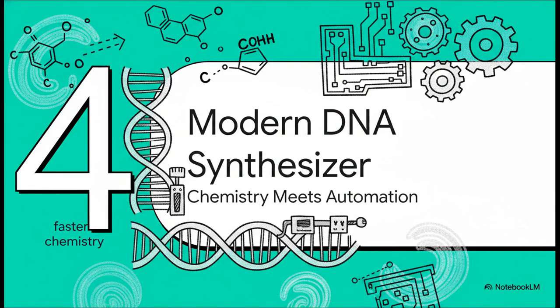So you take this new, souped-up chemistry, combine it with a few other key innovations, and suddenly you have the groundwork for the technology that powers everything today, the modern automated DNA synthesizer.